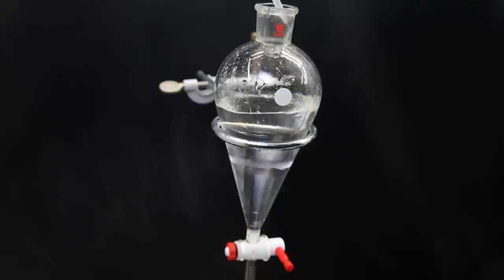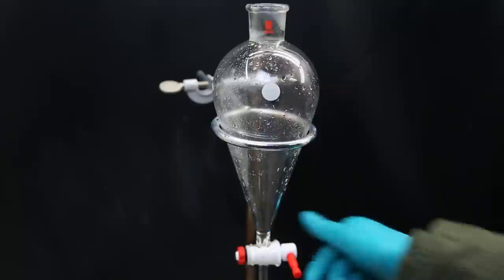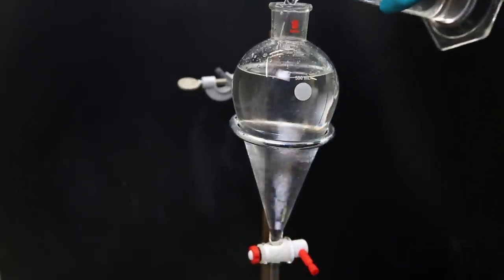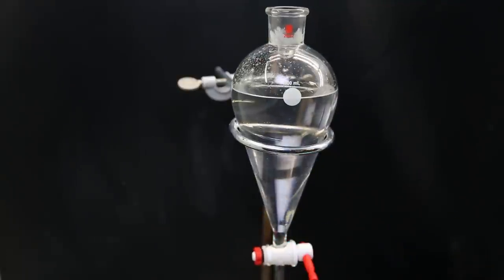I then add water to take up all of the pyridine hydrochloride. I shake the mixture, and then separate the layers. I then extract the water layer twice more with some pentane, to take out any product that might have moved into the water layer. I then wash the combined pentane layers twice with a 2 molar hydrochloric acid solution, which will react with any remaining pyridine and take it into the water layer.